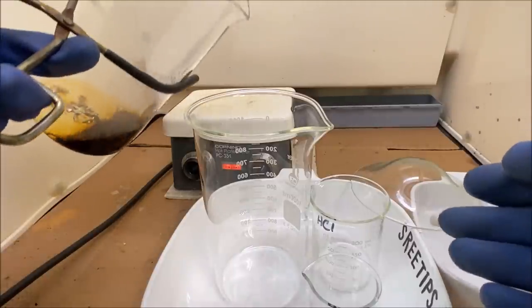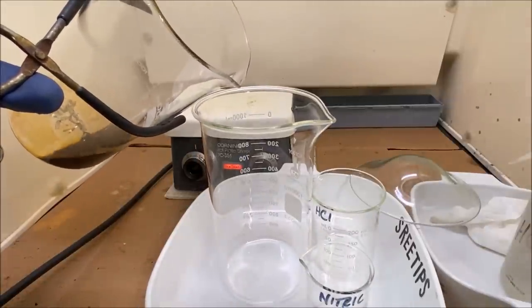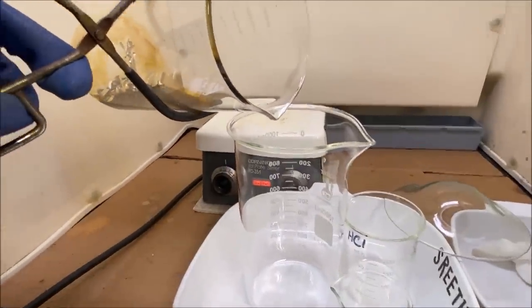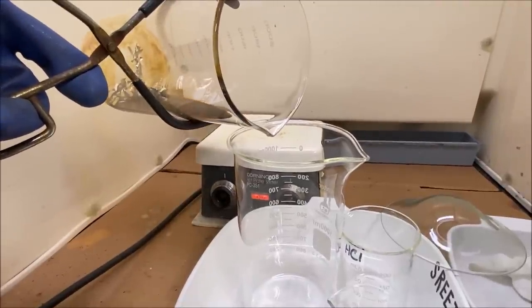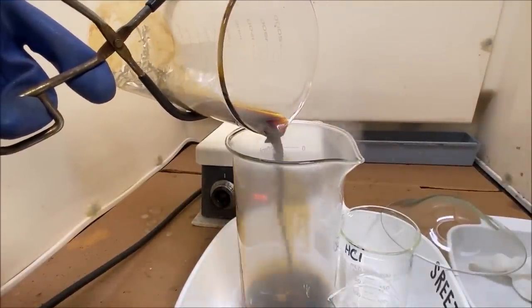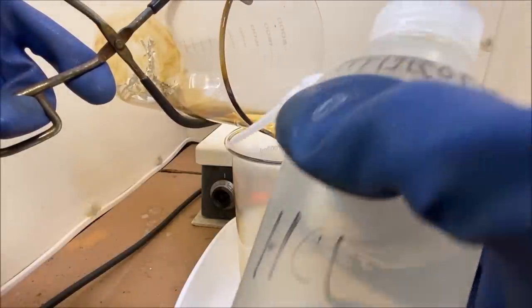Now what we're gonna do is pour off the solution that I have. You can see up there, there's still plenty of metal up inside the beaker. I'm gonna pour off this solution. I'm gonna rinse it out with some hydrochloric acid.